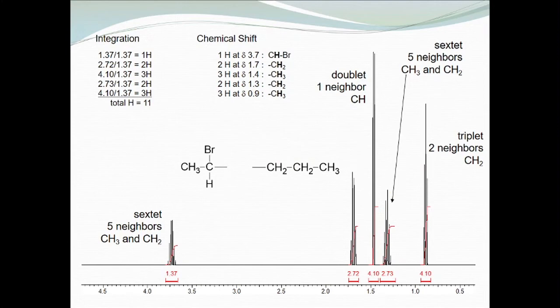Just go through the motions. This last peak at 1.7 ppm, this is a quartet. We have 2 peaks here, and then 2 more here. Again, it's not quite symmetrical, but very close, but still 4 definite peaks, so it is a quartet. There are 2 ways to have a quartet.